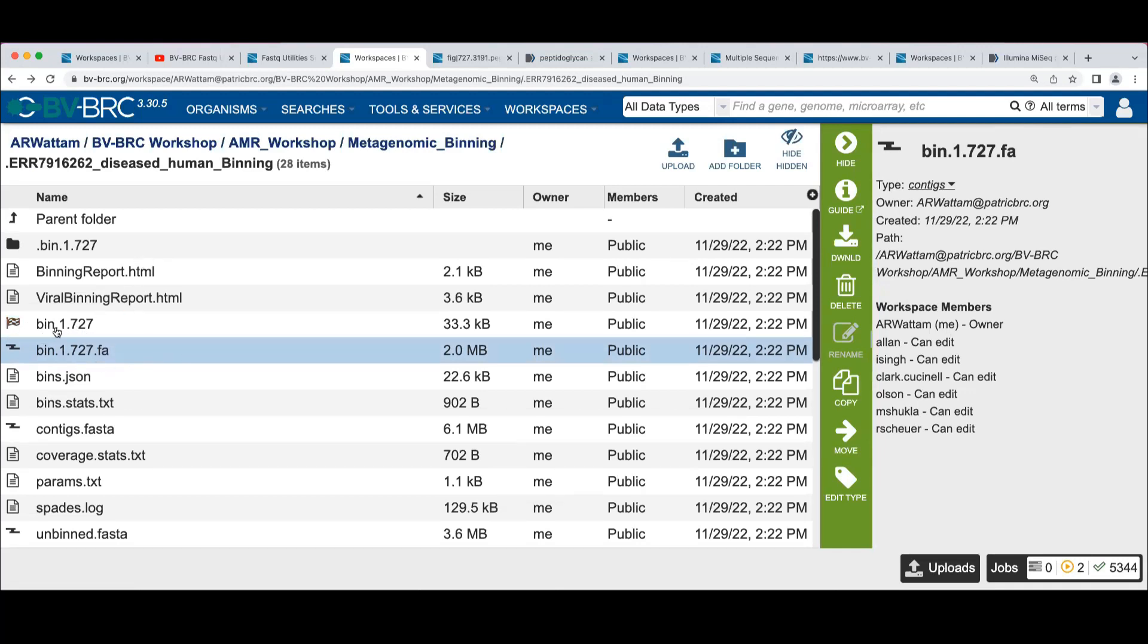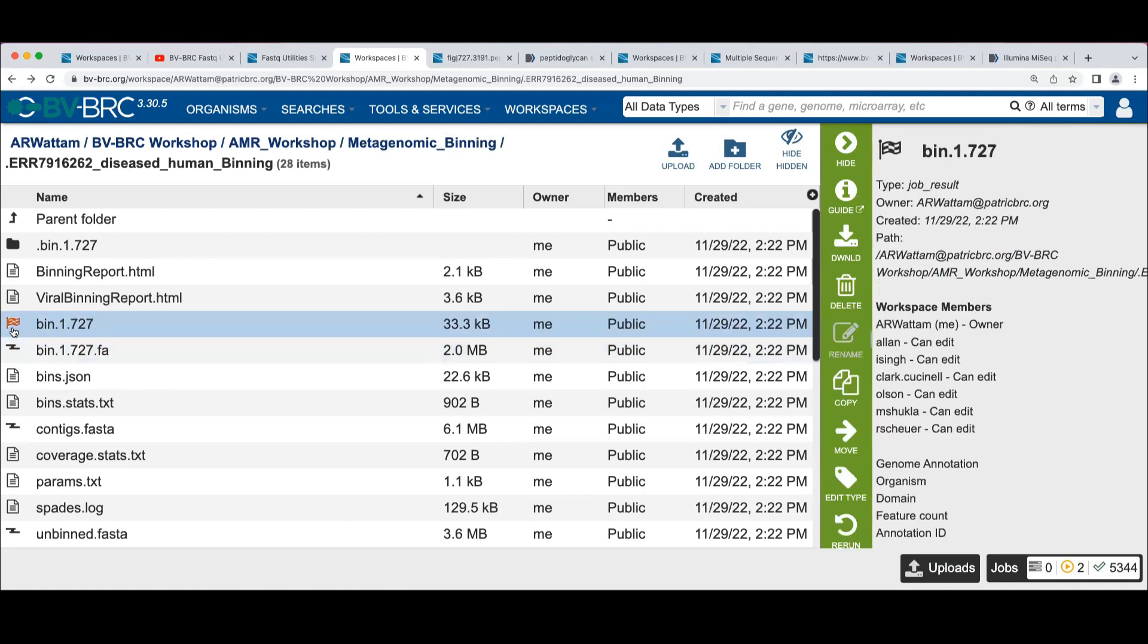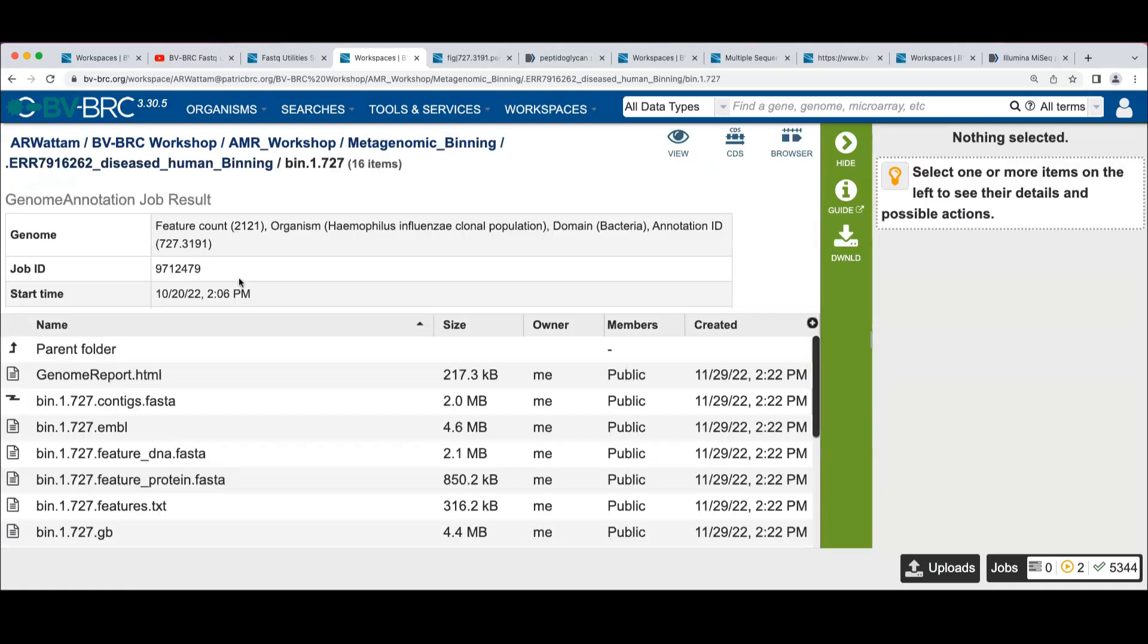We have a file here with a flag on it, which is the output of the annotation run for that, if you want to look at the underlying annotation.